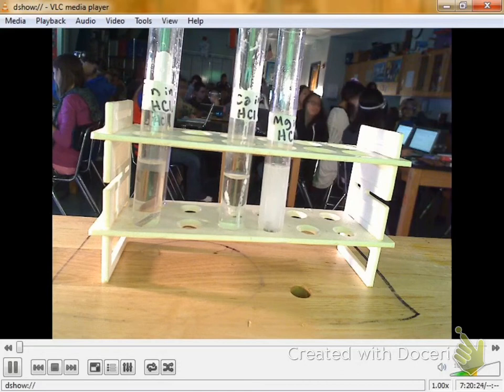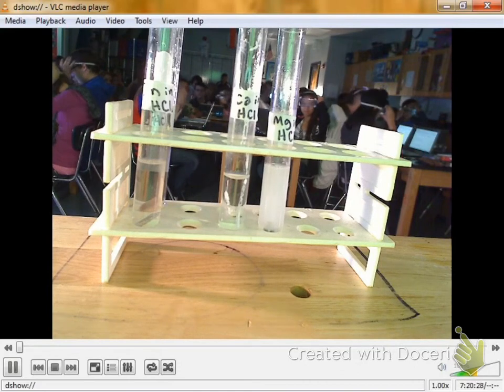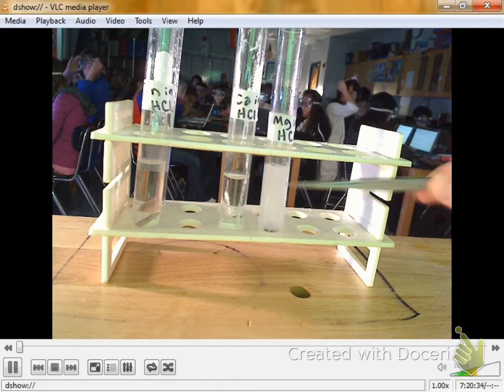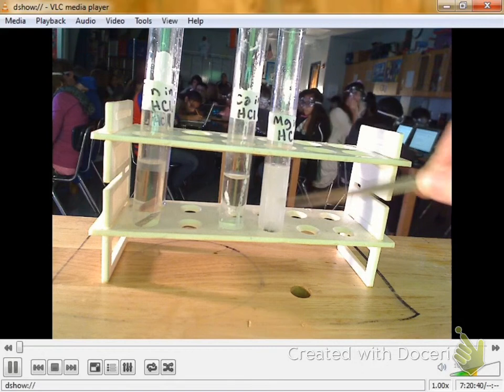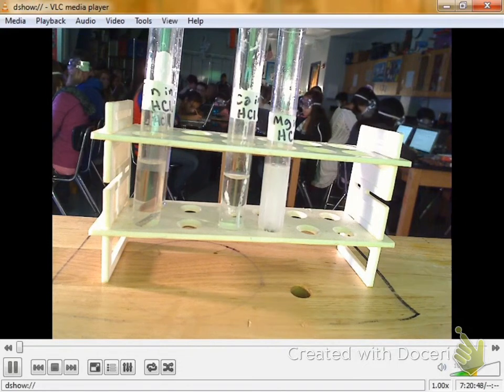It's not real exciting, but it is definitely reacting with the hydrochloric acid. Definitely got a bubble stream going now. Look at all the bubbles now. Now it's no longer clear liquid in there. And it's not that the water's changed different colors, it's just there's a lot of gas bubbles in there. So it's got that off-white looking color. Alright, we're going to let that finish while we talk about some calcium.